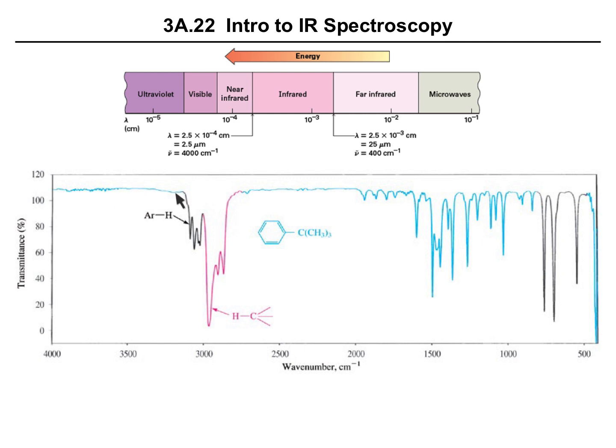So here we have no absorption because the energy of the photons does not match the energy required to stretch or bend a bond. Here we do have absorption because the energy that's being applied matches the energy to stretch. At this amount of energy, again, there's nothing absorbed, but now there is energy being absorbed, causing different types of bond vibrations.